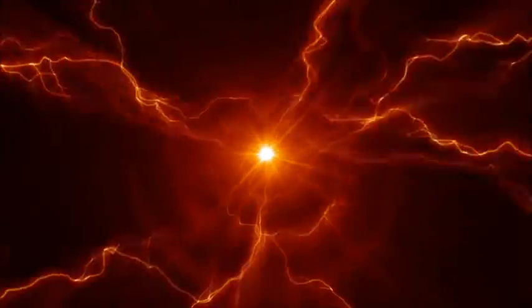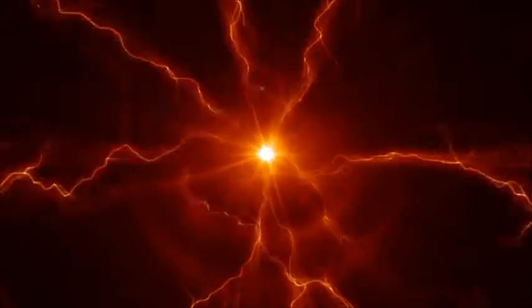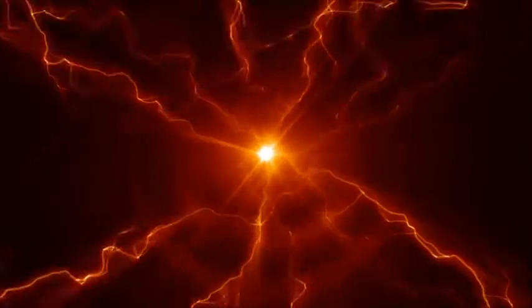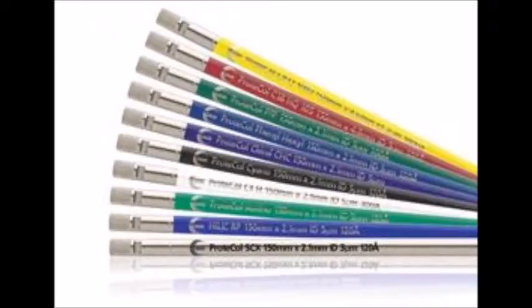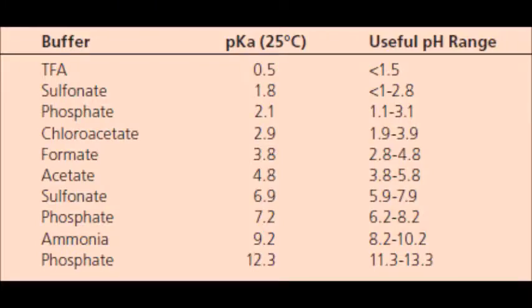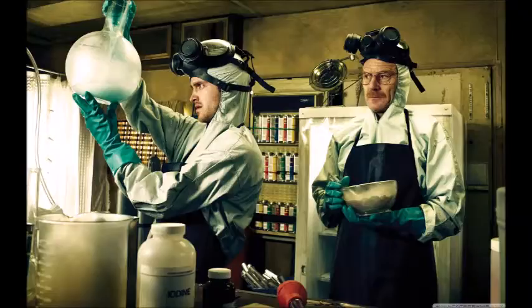The benefits of HPLC are: HPLC is highly accurate and incredibly fast. The stationary phases are reusable, but over time they will degrade, and this will be noticeable in the results. It is reasonably easy to use, but one could spend most of their life mastering it. With the ability to change the column, mobile phase, and its concentrations, for example using an isocratic concentration or a gradient concentration depending on the analyte, and changing the detector to suit the analyte and the mobile phase, HPLC has a wide range of very diverse analytical abilities.